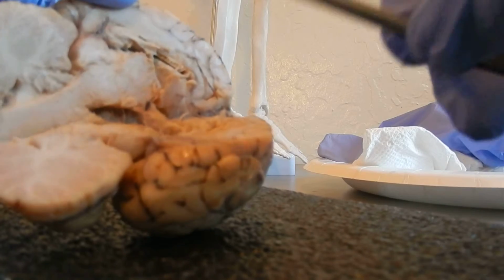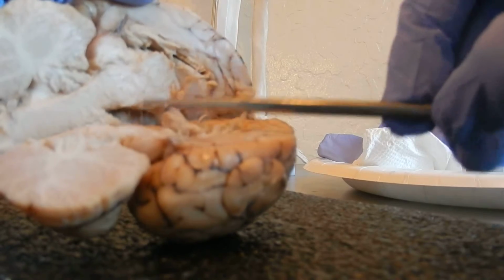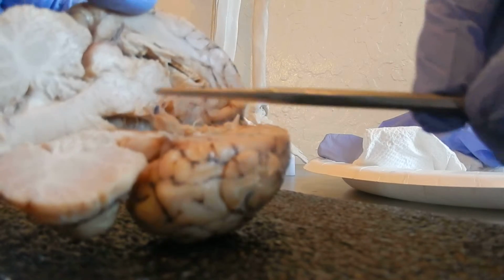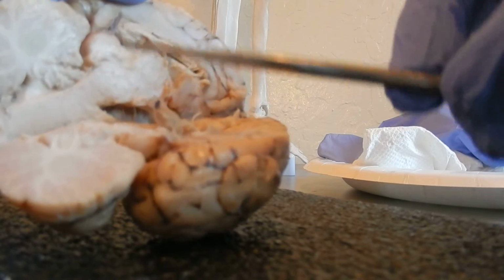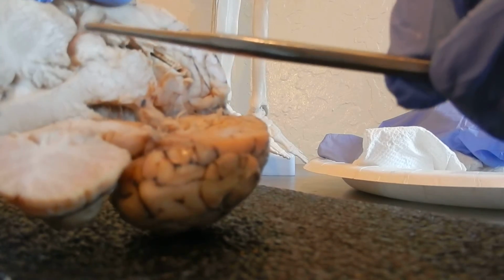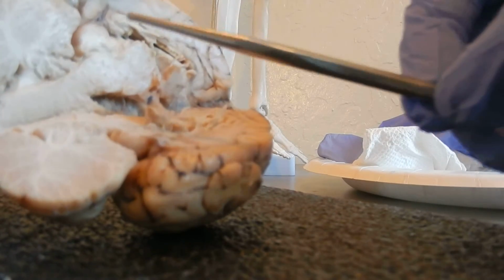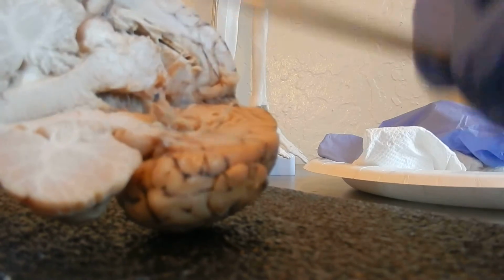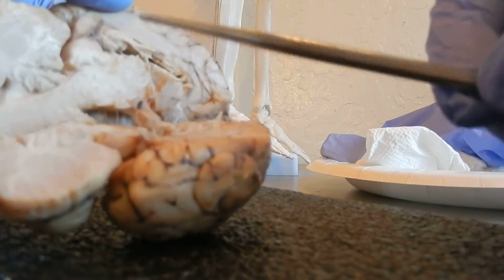A few other areas. Again, you can see here the massa intermedia, the thalamus right there, and you can also see right in here, right next to it, the anterior commissure. And then if you look a little bit more closely, right here, you can see the superior colliculus, the pineal gland, and the inferior colliculus. And again, that makes up the corpora quadrigemina.